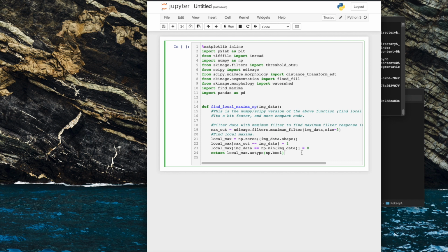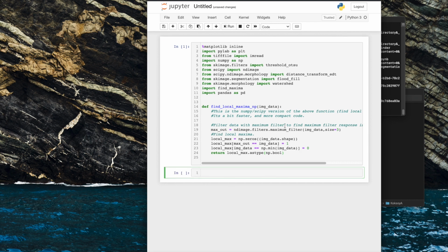So the first thing to do is just to run that cell, make sure that you get a number here and no errors, so all of those libraries have been imported correctly. Obviously, if you have a problem there, then you'll have to address which of the modules hasn't been loaded and then install it before running again.